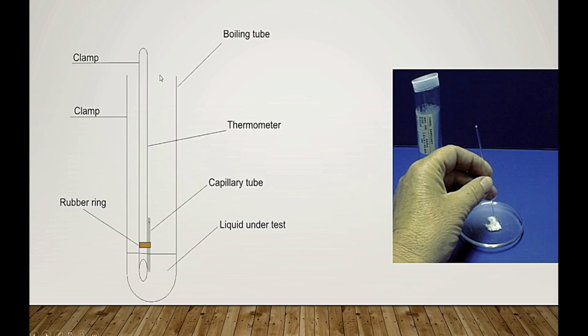In this diagram, you can see it is attached with the thermometer to determine the boiling point of any liquid. In this diagram, the sample is being placed for determining melting point.